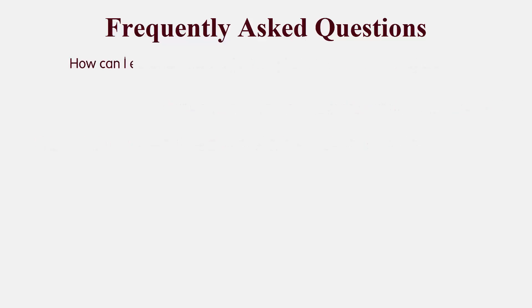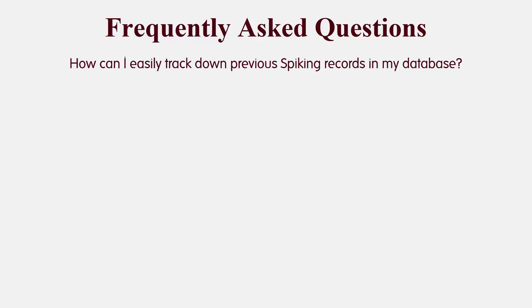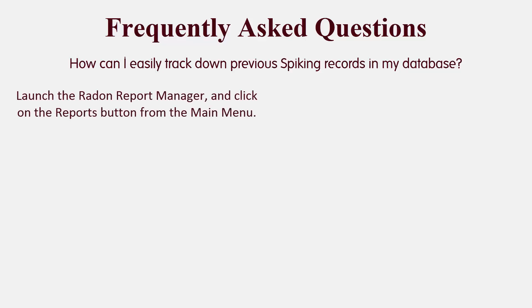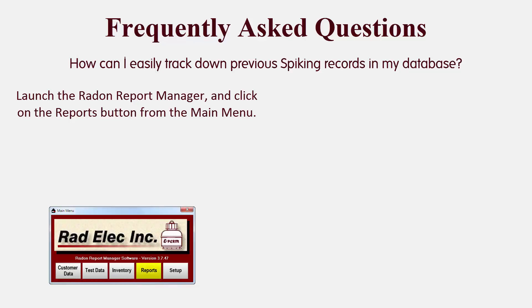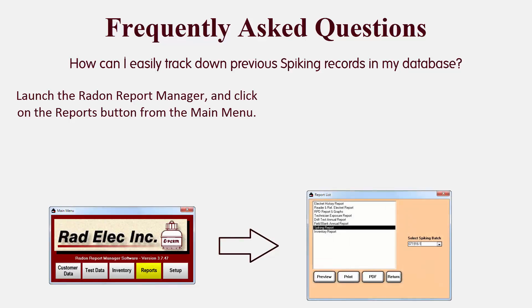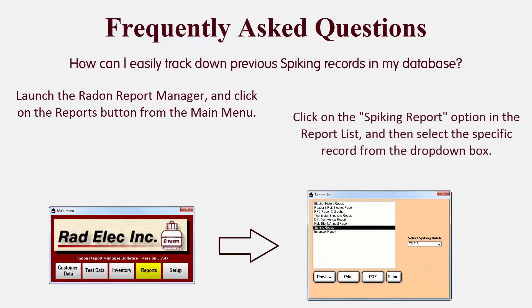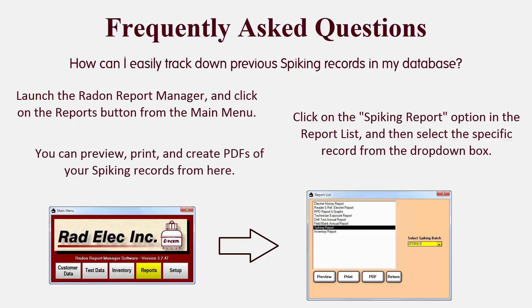How can I easily track down previous spiking records in my database? In order to find all completed spiking records in the Radon Report Manager, launch the software and click on the Reports button from the main menu. Click on the Spiking Report option in the report list, and then select the specific record from the drop-down box in the right portion of the window. You can preview, print, and create PDFs of your spiking records from here. Note that this is only for tracking down completed spiking records — you are not able to load the record for editing purposes from this reports window.